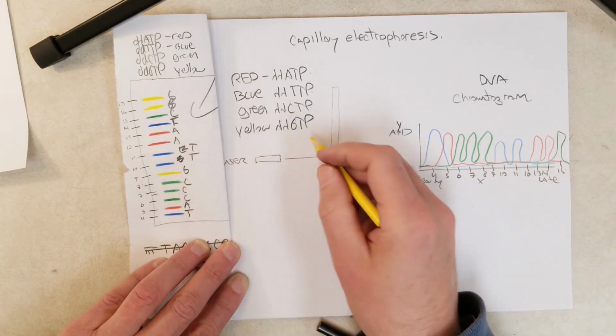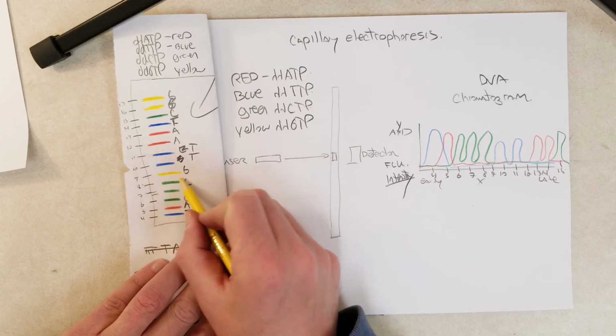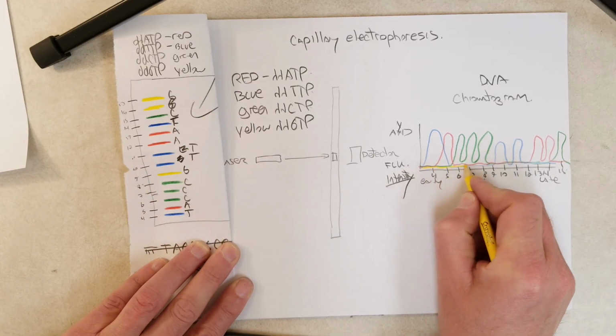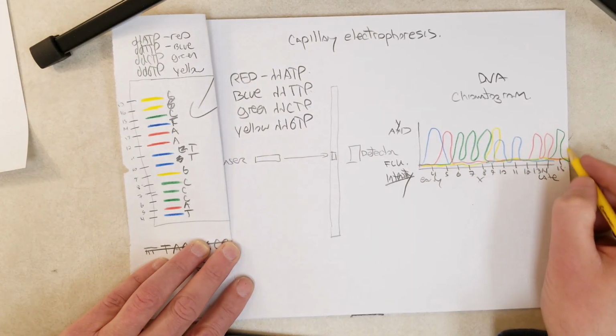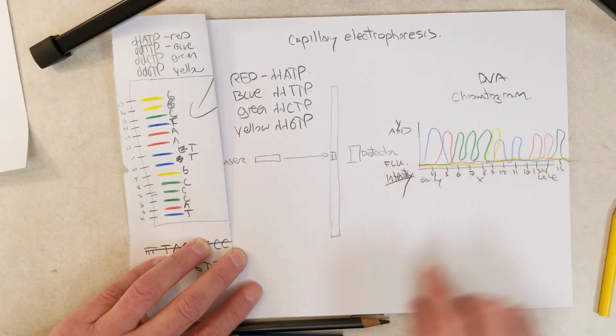And the last color it's looking for is yellow. It should have seen a yellow at about 9, 16, and 17. So we should see a blip of yellow right about here. Then not another one until we're off the screen here. Okay, so this is what a DNA chromatogram looks like.